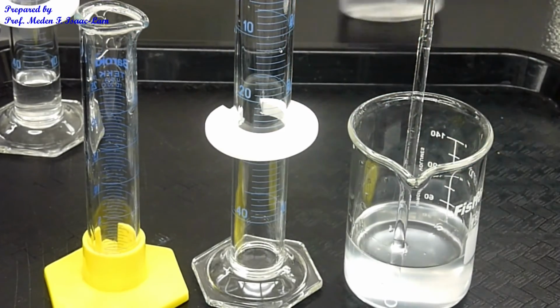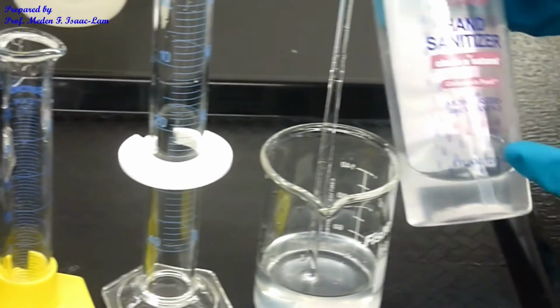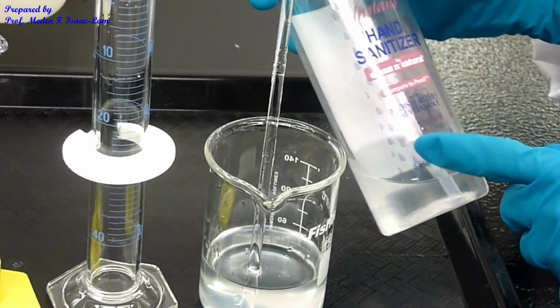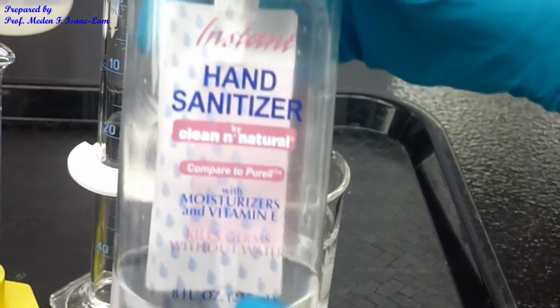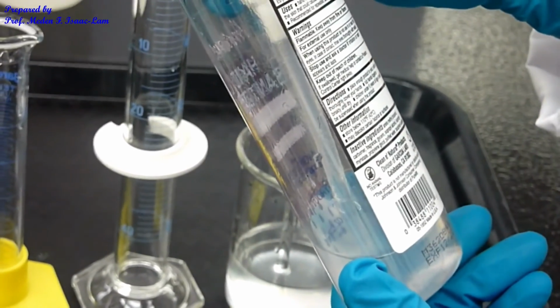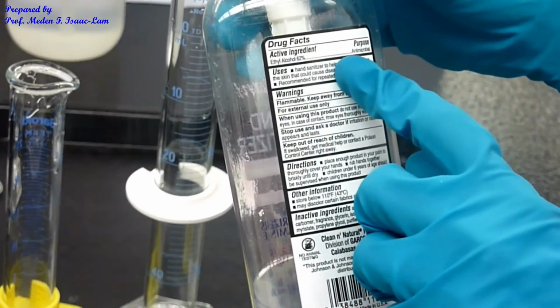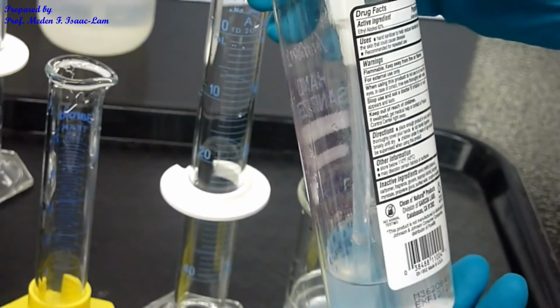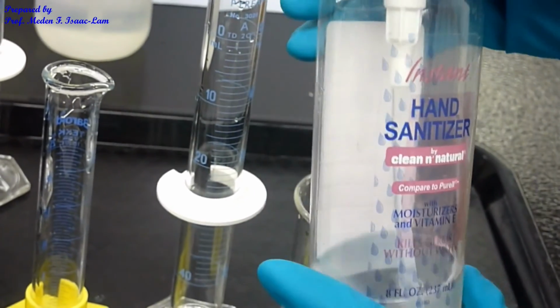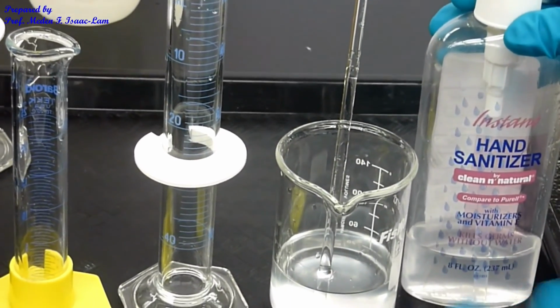And I have here a hand sanitizer in the lab, so you can see that it actually has some turbidity, and they said that it's with moisturizers and vitamin E. So this is the hand sanitizer. They said that the ethyl alcohol antibacterial is 62% in this clear and natural product, right? So this is the commercially available hand sanitizer, and ours is not far off, right?